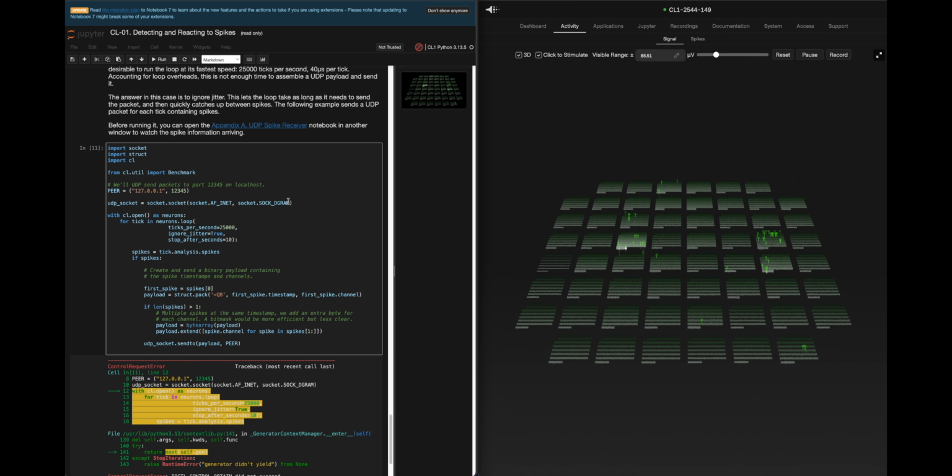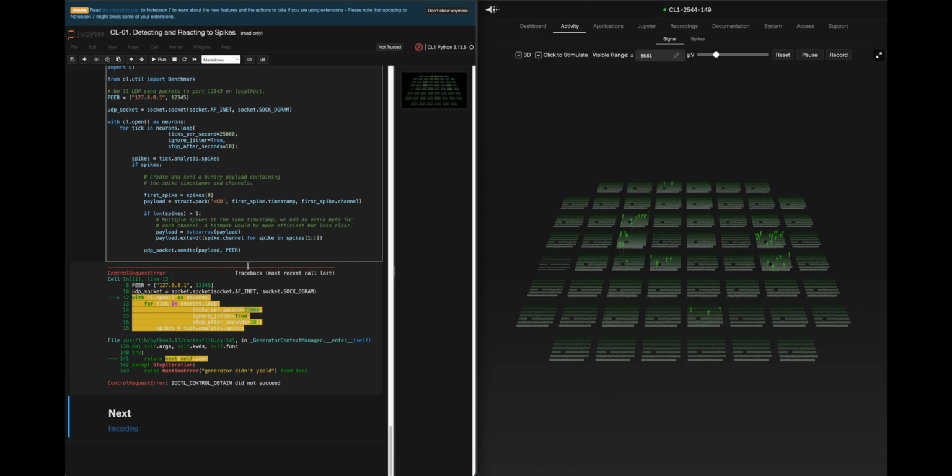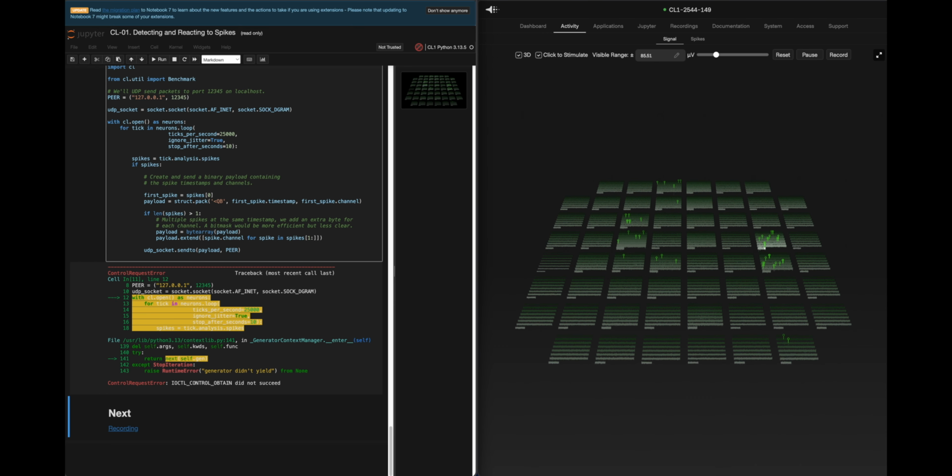Again, I'm a big fan of the Jupyter kernel because you're just running things directly on the Jupyter kernel and then extracting the data later in HDF5 format, which will probably be another video. I don't think it's included in this one. It actually is, it looks like it is. So, pretty much perfect right there. But let's really explain what happened here, because this is something I really want to hone in on with people: you don't always want to stream over UDP.